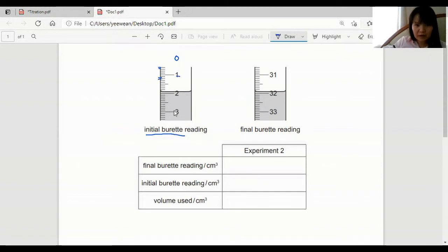When you see the reading like this, read the one at the bottom most. So this would be 1.9.